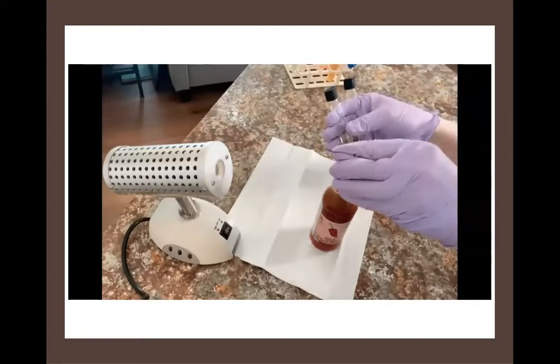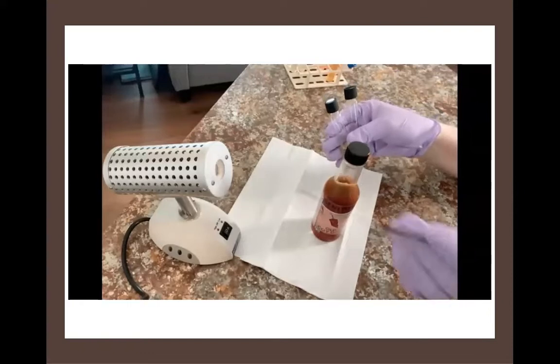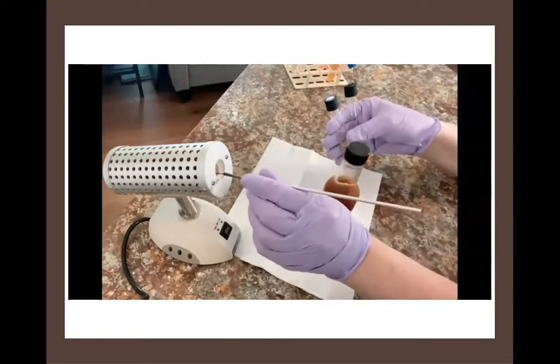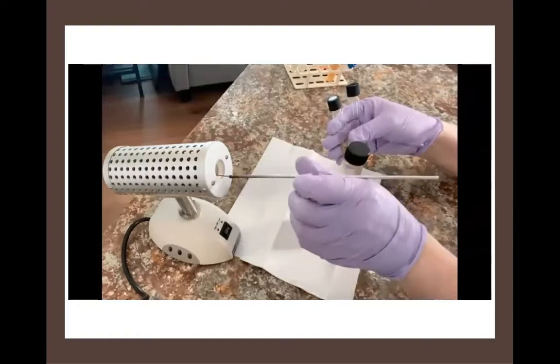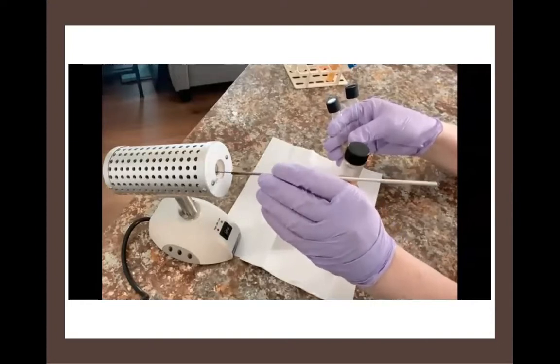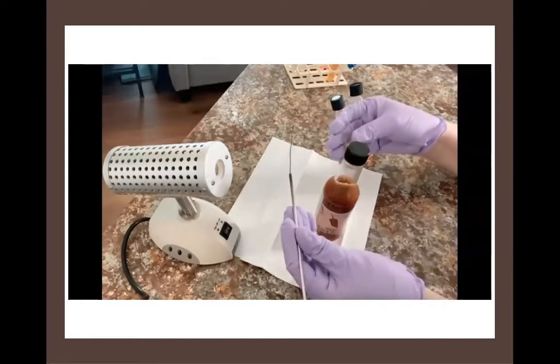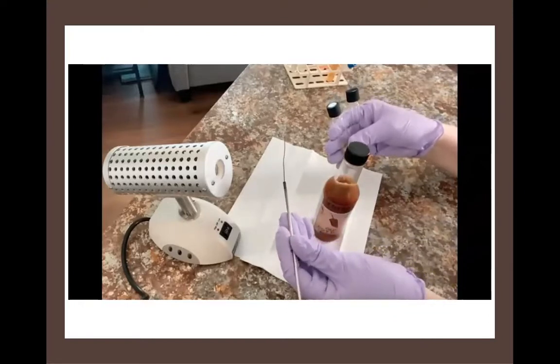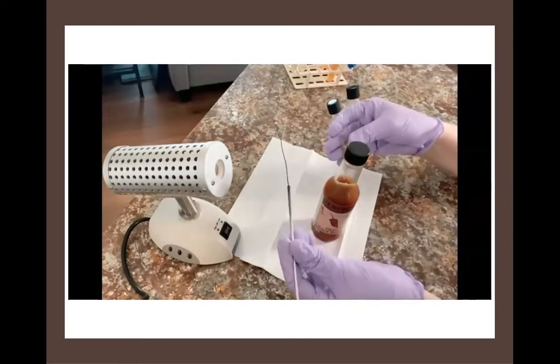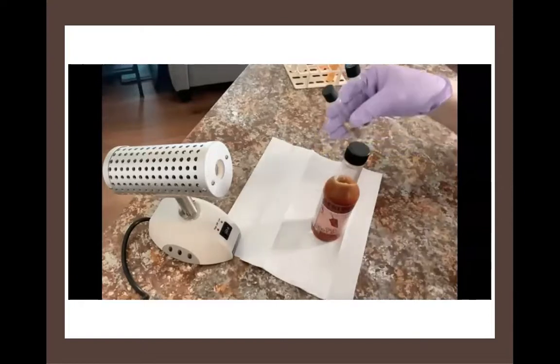Okay. Now, first thing I'm going to do is sterilize my inoculating loop. That needs to be into the incinerator until the wire is red hot. For purposes of the demonstration, I'm going to shorten that up a little bit. We'll pretend that we're red hot. Now we have to hold it until it cools off. Remember, approximately 20 seconds. You can count in your head. Now it's important that you get that loop comfortable in your hand for the next part.